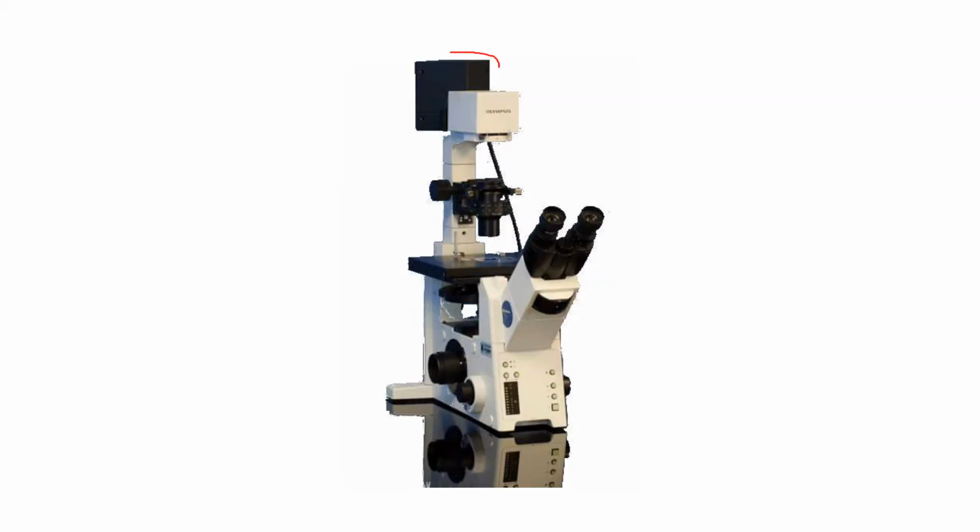Now this is the confocal microscope. I want you to look at it and observe it. We have a UV light source, and we are ensuring that only the UV light source hits our specimen and not ourselves. All the detectors and everything are here.